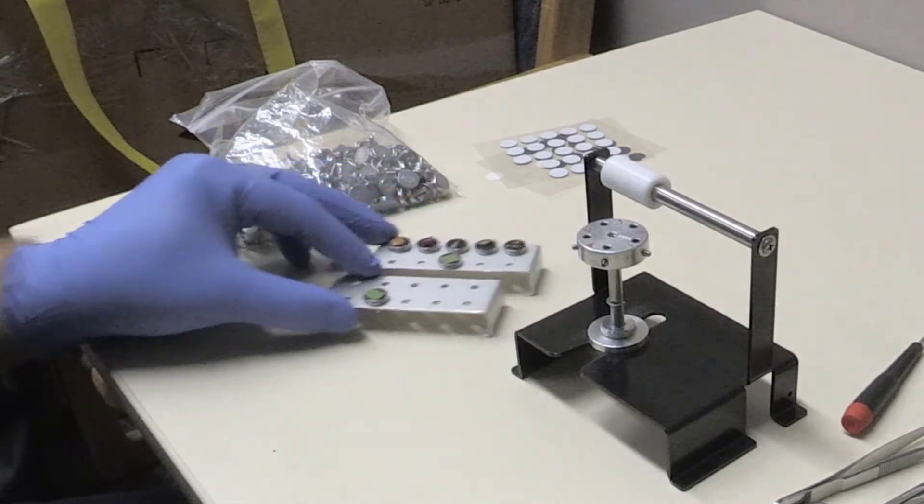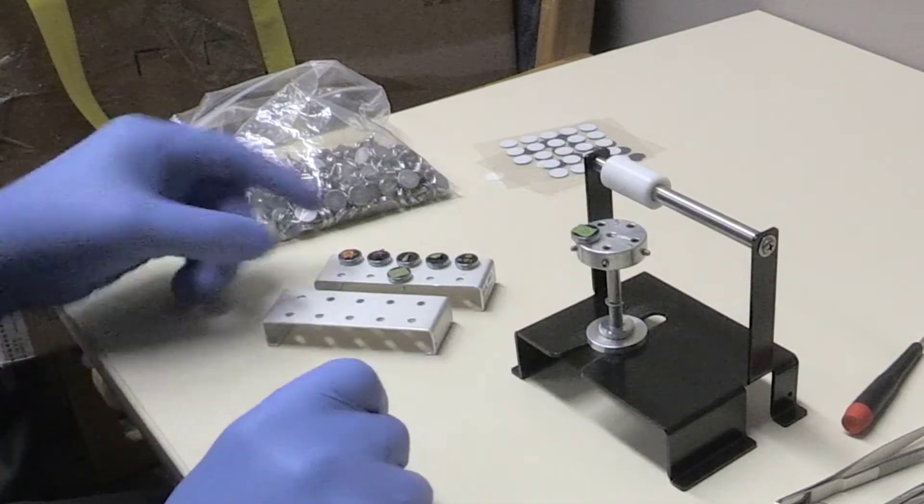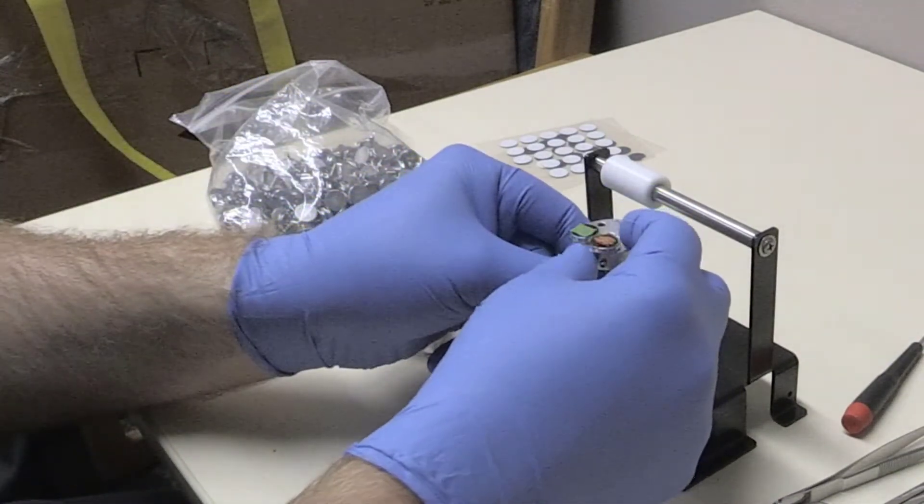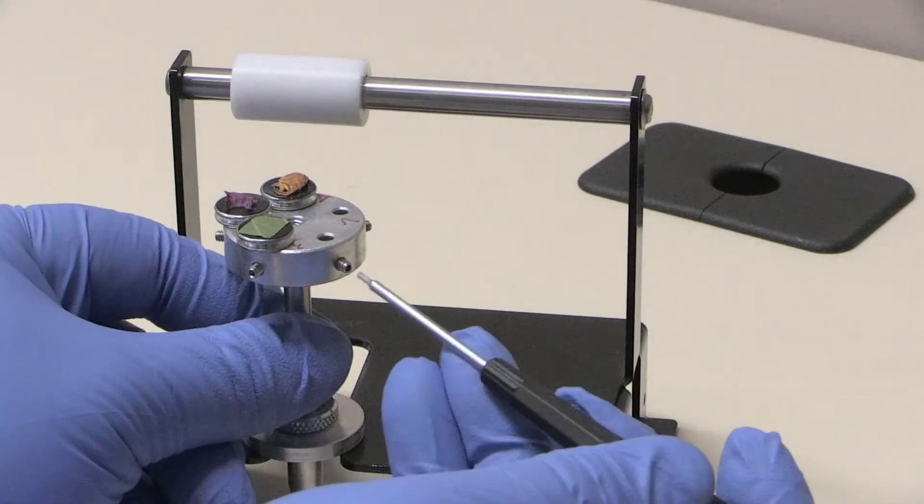When all of your specimens have been prepared, add up to five pins into the specimen stub. Secure the mounting pins to the stage by turning the small side screws gently.